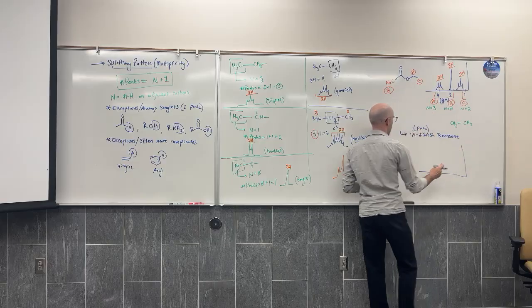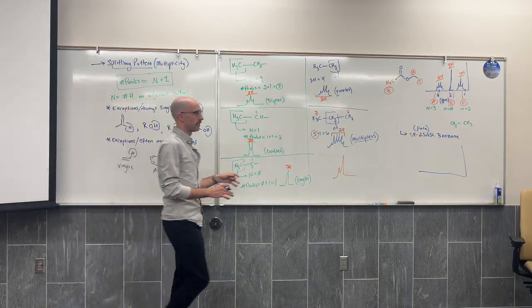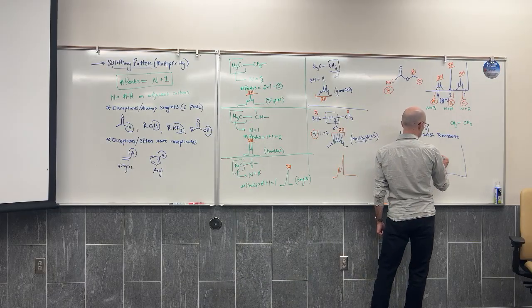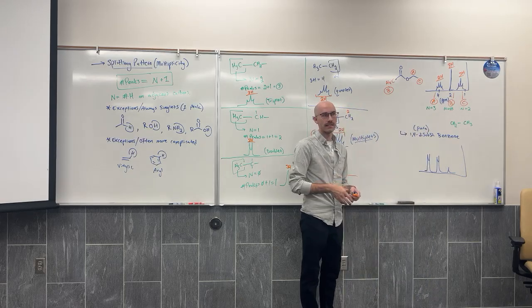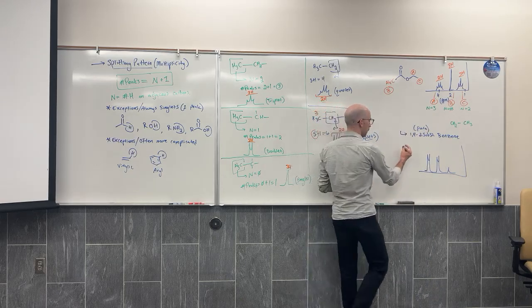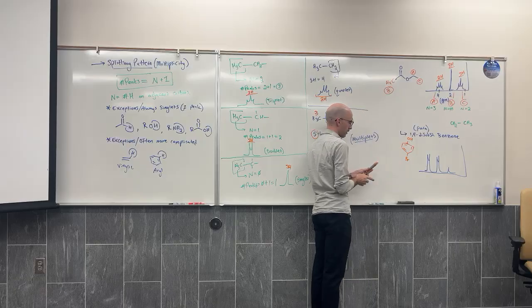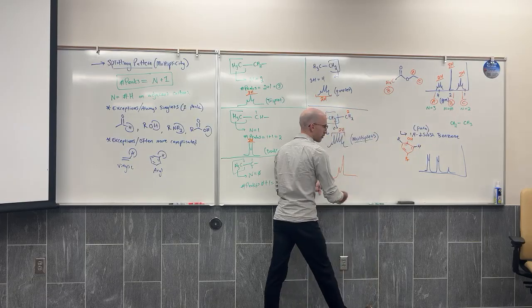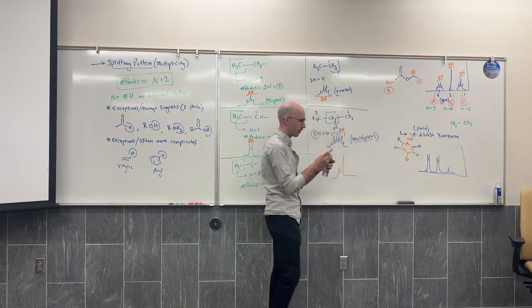And I told you guys that aryl hydrogens can be quite complicated sometimes, but it turns out when you have a 1,4 di-substituted group, you get these two nice doublets, just like you'd expect, because your aromatic ring has two sets of symmetric hydrogens, each with one neighbor.